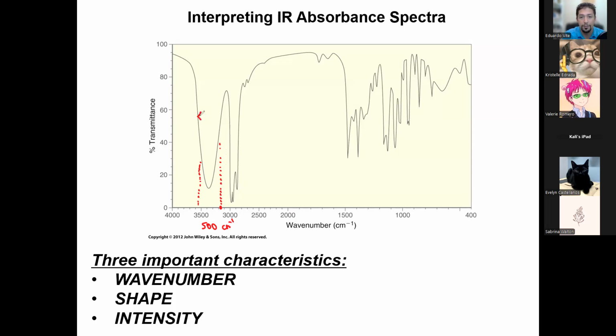You could also just see it visually yourself. Look at this. It spreads out over quite a bit. So I would call this peak broad. What would you call this peak right here? How would you describe that peak? Sharp, right? Sharp, very narrow. The proper way is very sharp. That's what we say. VS, very sharp, or we just say VS, very sharp, right?